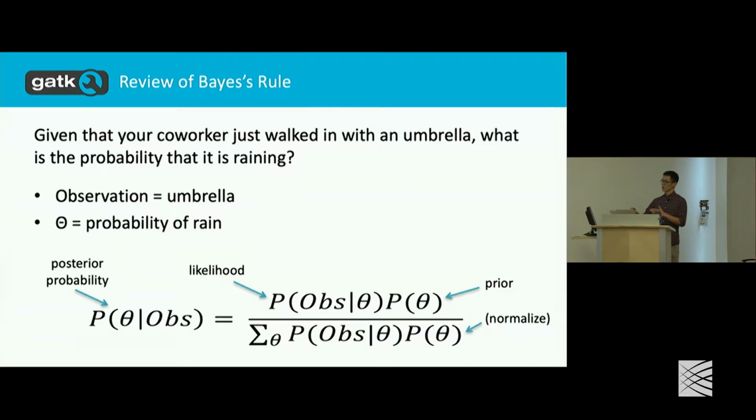Likewise, if you have an allele that you rarely ever see in the population, like a mutation at that particular locus, perhaps one that messes up the ribosome, then you never see those.